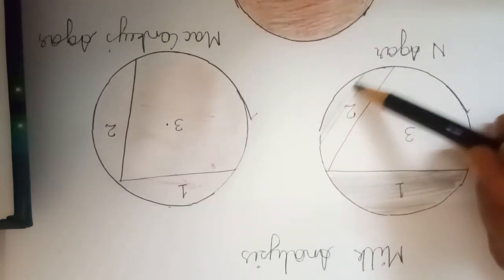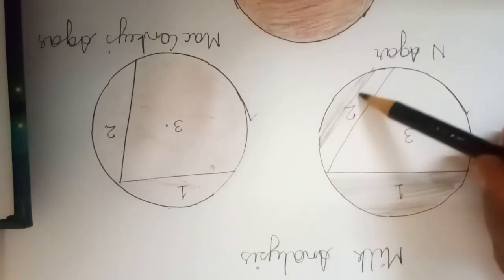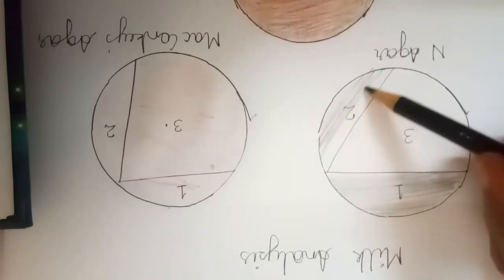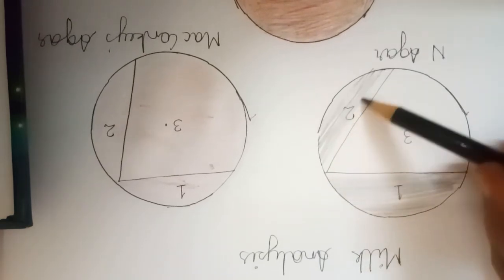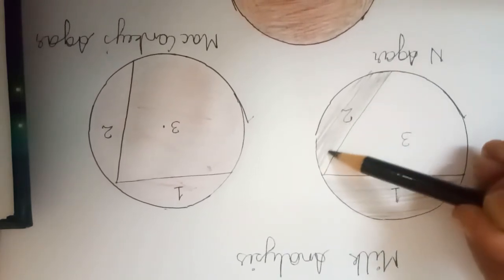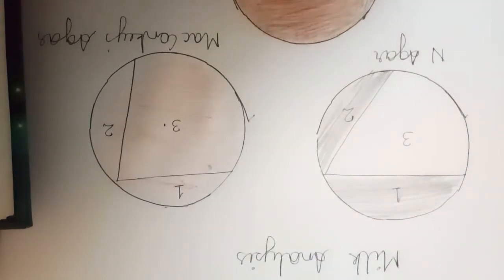Okay, it is to be done like this. So our second sector is already inoculated.